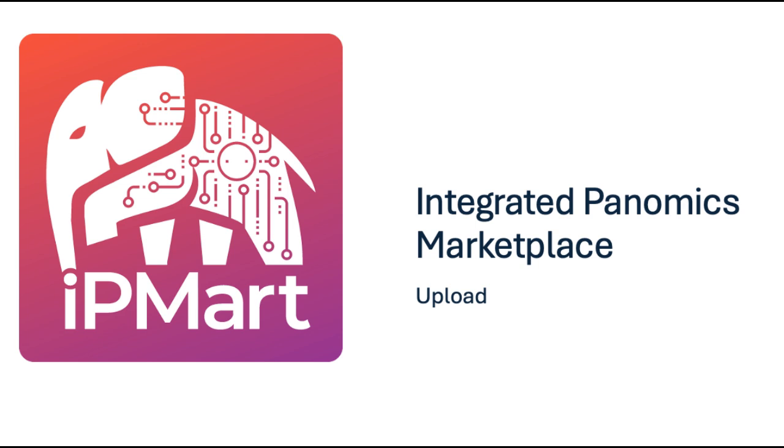Welcome to the iPMart video, where we will walk through how to upload data to iPMart. First, we will cover how to create a multi-omics project.